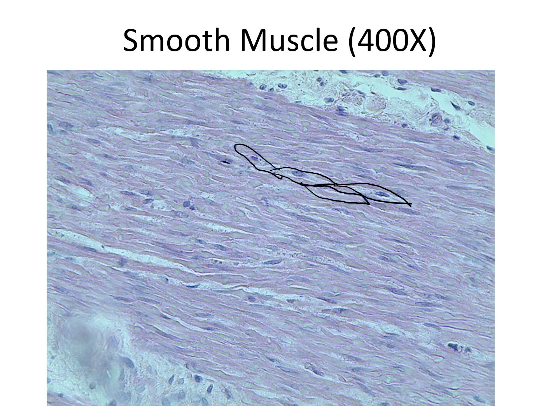So you will see lots of these dark dots that are nuclei. Here's a whole cell with the nucleus inside, and here's another cell and another cell. We don't have that much extracellular matrix here at all. So those are smooth muscles. They do not have any striations. They're spindle shaped, and they're uninucleated.